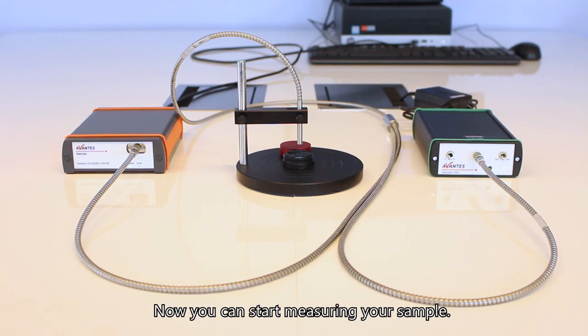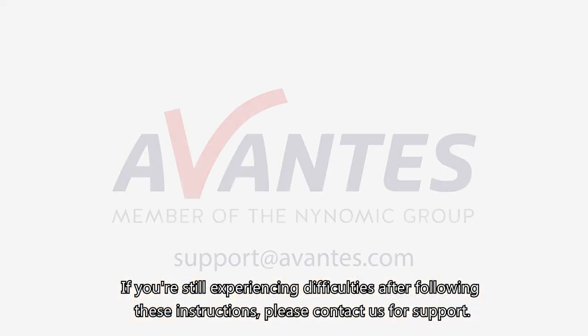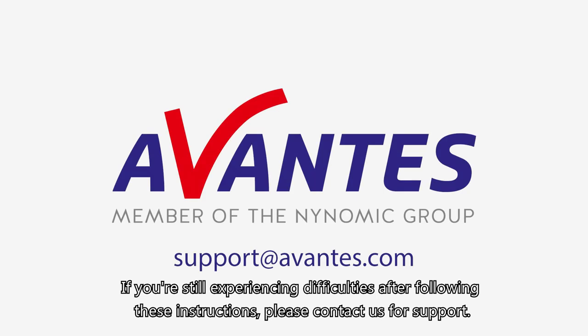Now you can start measuring your sample. If you're still experiencing difficulties after following these instructions, please contact us for support.